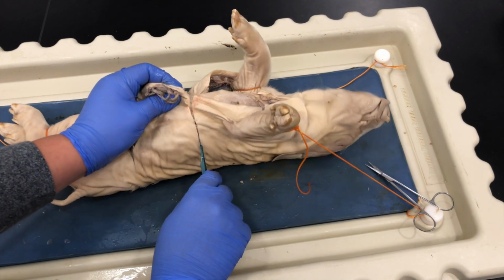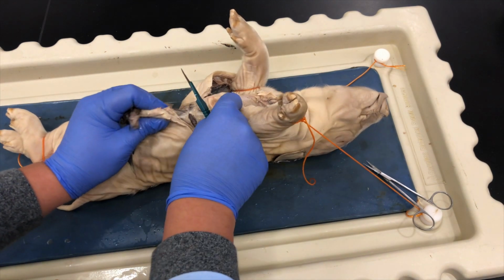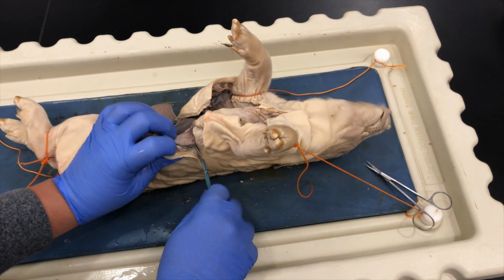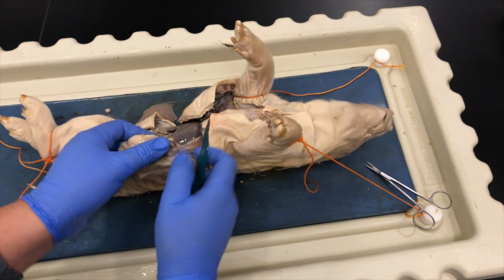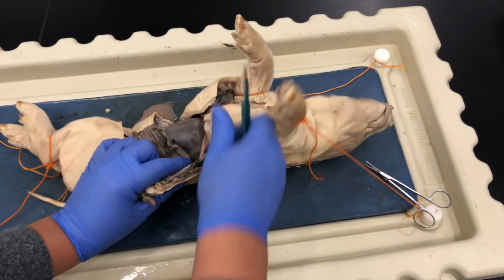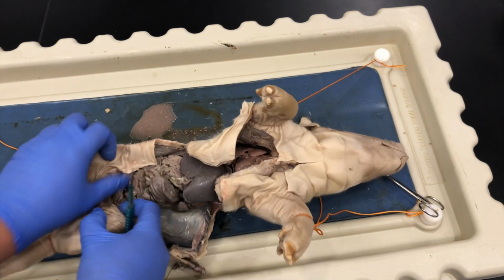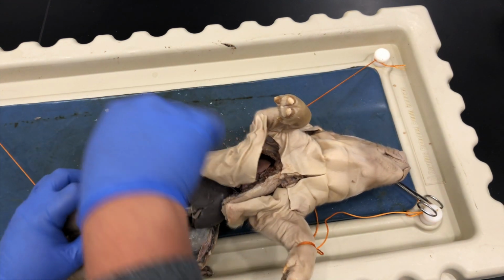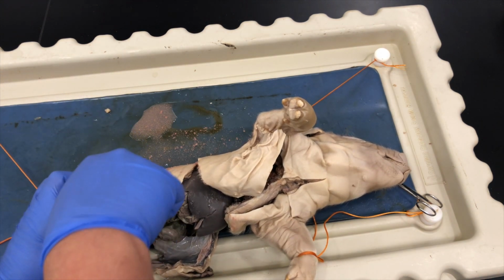Here I am doing a straight cut on this side of the fetal pig, trying to create another flap. Again, you have to be very careful not to pierce any of the organs because you might be cutting through it and you will mess up the organs and it just won't look right when you're taking pictures or observing it or whatever it is that you're doing.